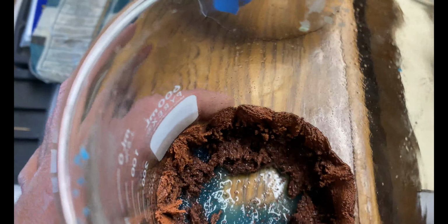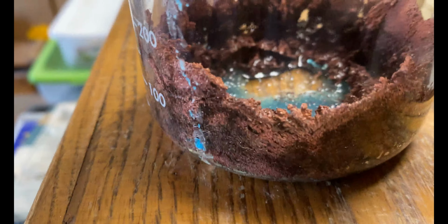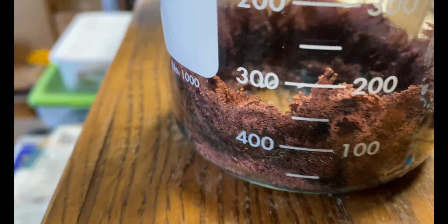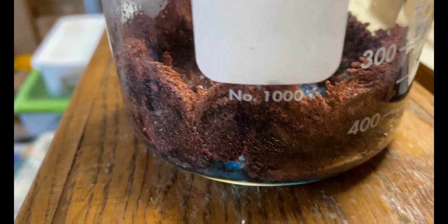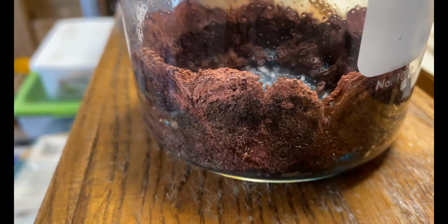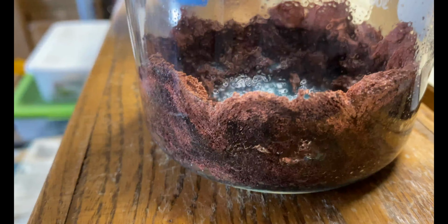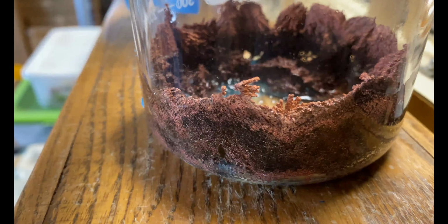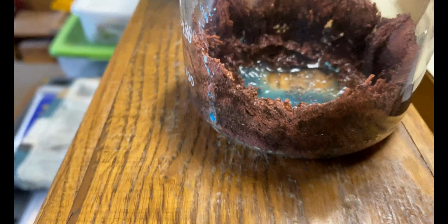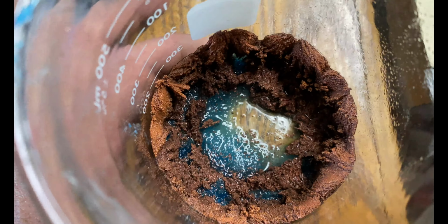And if you look at the perimeter, you can see the shape of the magnetic coils. You can kind of pick up on it. They're sort of like clam shapes. See, there's one, and there's the other. You can see this sort of like the cross section, like if you sliced an apple in half, you can see that little shape in here as the magnetic field worked its way around. And it did seem to form to that shape, which is really cool.